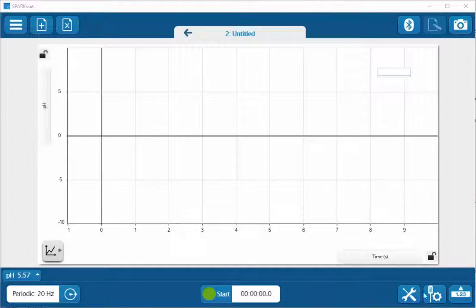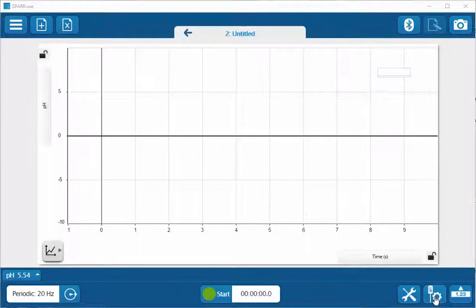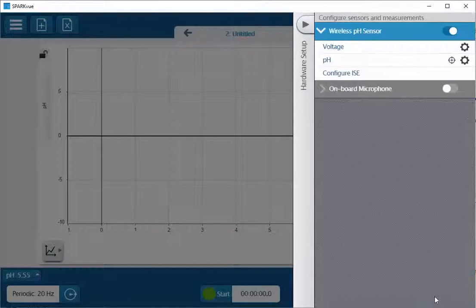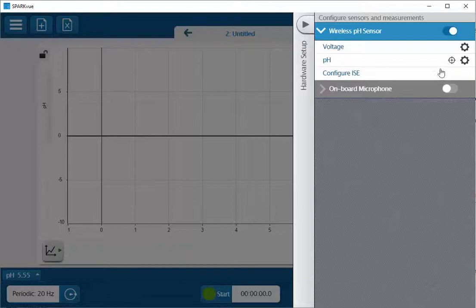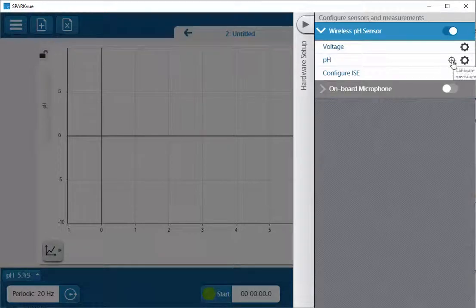I'm going to access my calibration menu by selecting on the hardware setup menu and then selecting the crosshairs to the left of the gear on the line with the pH.